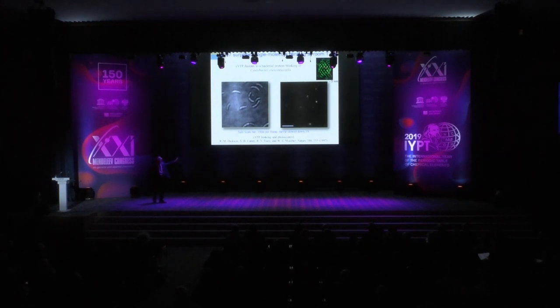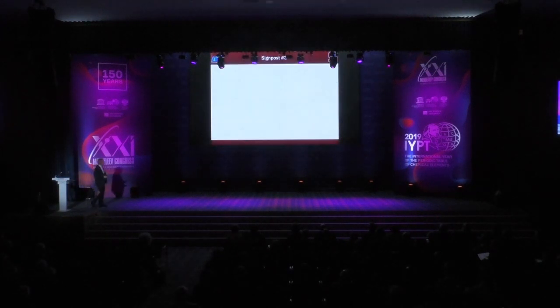And here there's no motion. So please don't be confused. That earlier movie was showing motion, things moving around. Here there's no motion. All of this is just the blinking of fixed molecules, which are going to be useful in a few minutes. But you see, again, people said, oh, what good are single molecules? They blink too much and so on. It's not so interesting. Well, we'll see.